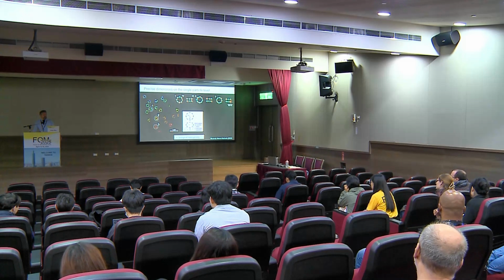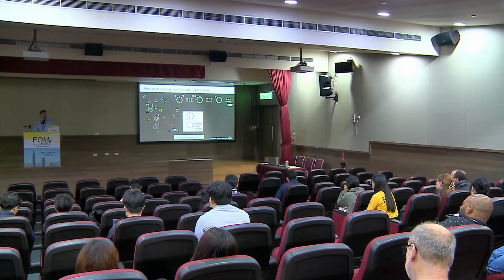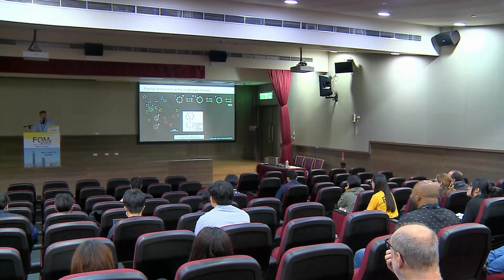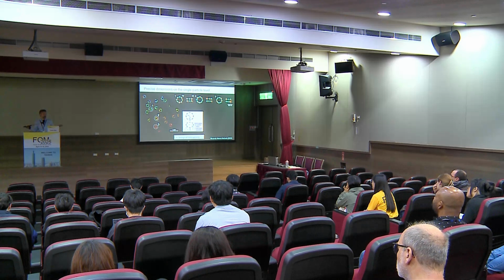Just a question about the simulator of the MINFLUX. Which programming language is it based on? MATLAB or Python, maybe? So it's both. Actually, we coded it in both languages because the community is still split. Some people like to use MATLAB, the others use Python.